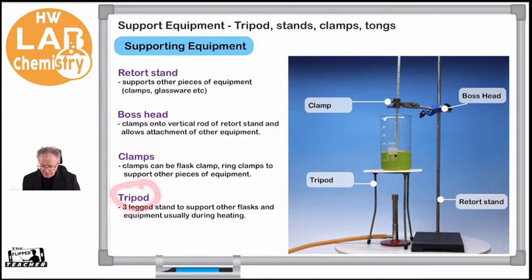Then we have our tripod. The tripod is a very pivotal piece of equipment when we're heating, because more often than not, when we're heating large volumes of water, we want to hold that water above the Bunsen burner at a fixed distance. We generally use a tripod for this. "Tri" means three, and that's because it has three legs. It supports other flasks that we might want to heat.